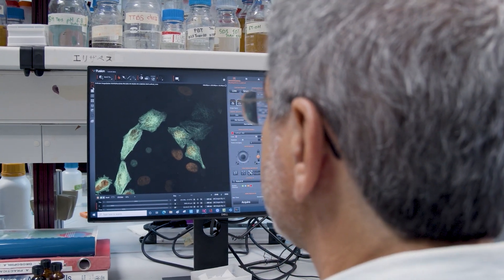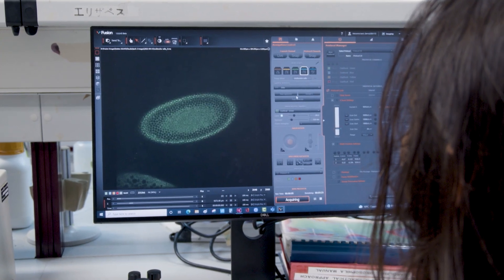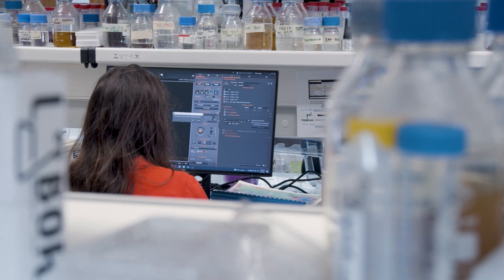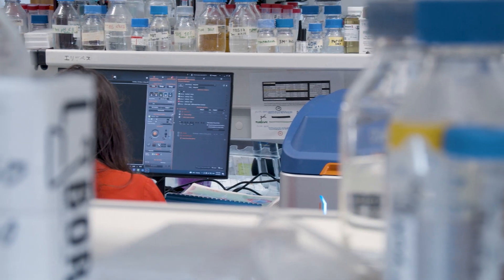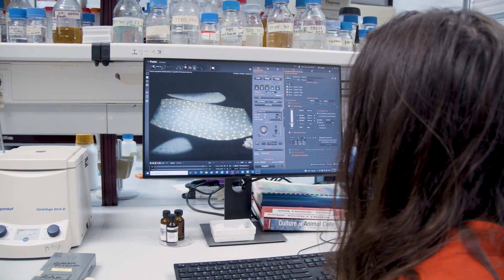So in a group like mine, it's an ideal microscope. Usually with the BC43, what I do with my Drosophila embryo samples is that I set up the whole experiment to acquire it, and then I set up to automatically stitch and deconvolute that experiment. So I can be on one bench working on one experiment while running my acquisition — able to do both things at the same time. That's the major advantage that I see with the BC43.